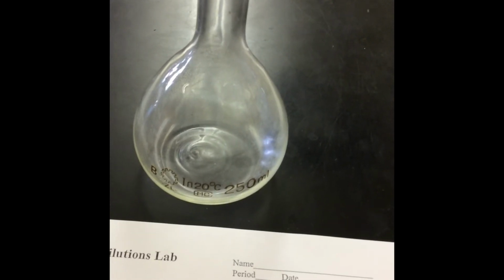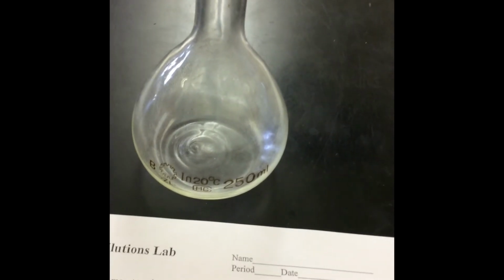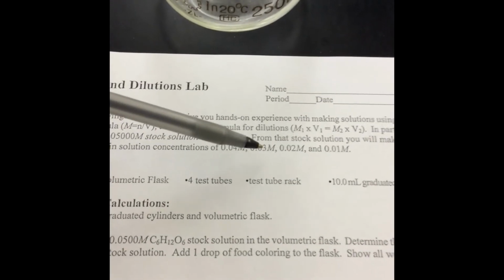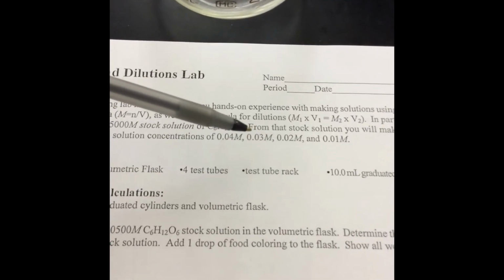Since all you're using is water, sugar, and food dye, nothing is toxic at all. It doesn't really matter if you get a little bit of that liquid on your skin, but you just want to turn it upside down a couple times just to make sure it's evenly mixed. Now, in reality, if you wanted to make very precise dilutions, you would then use smaller volumetric flasks to do that.